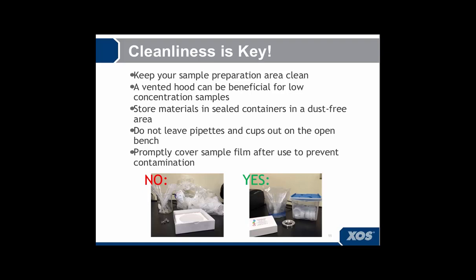Don't leave pipettes and cups out on an open bench, and promptly cover your sample film after use to prevent contamination. I've given you a couple pictures at the bottom of two potential setups. The setup on the left can lead to contamination, whereas the setup on the right, where everything is covered and kept dust-free, you will avoid contamination.